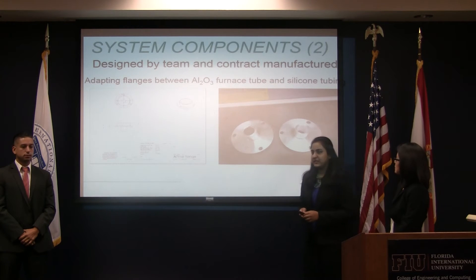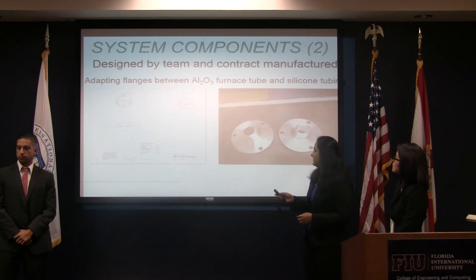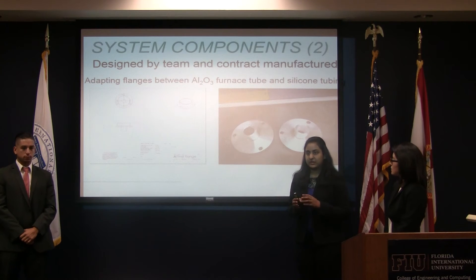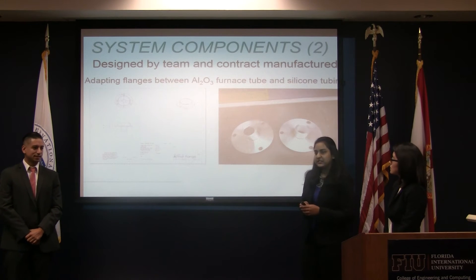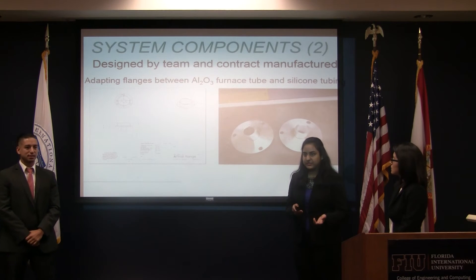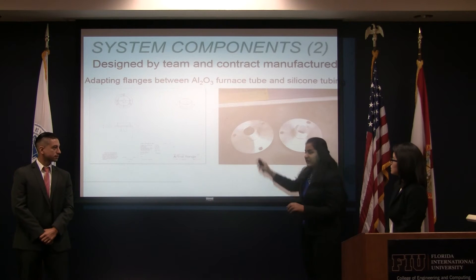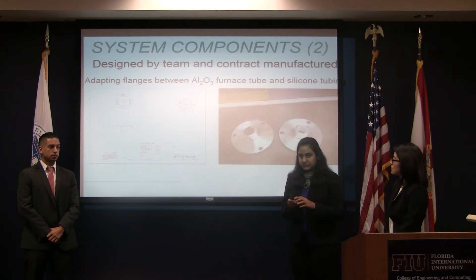The next section is parts we designed and then got custom manufactured. The first is adopting flanges for the furnace tube, which would connect the furnace tube to the tubing we have. These are made out of stainless steel, high temperature, and we made the outer diameter where we connect the tubing to be slightly larger than the inner diameter of the tubing so that there's a tight fit.